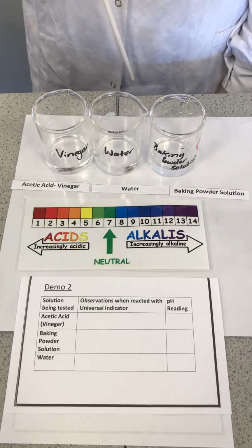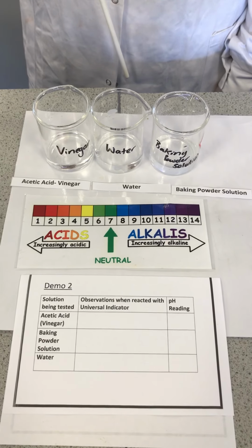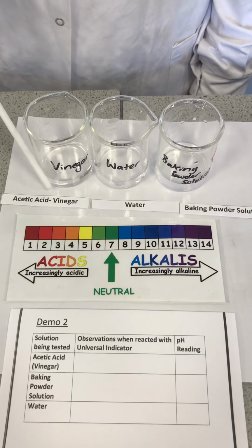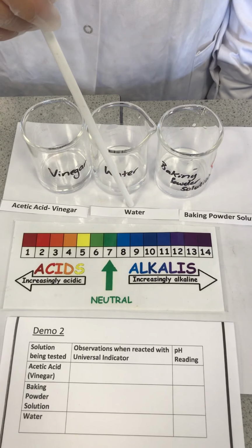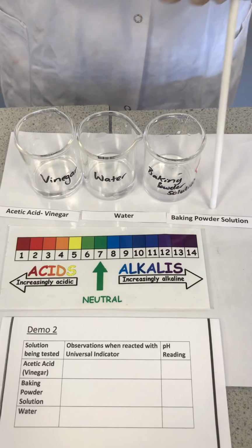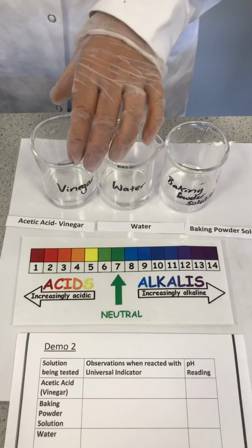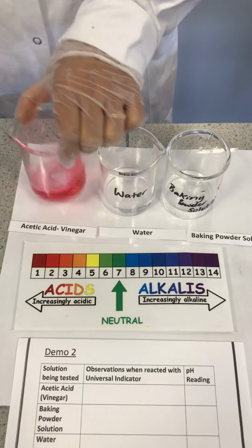Experiment 2, neutralization. Mixing acid and alkali together to make salt and water. We have 3 different beakers which contain vinegar, which is acetic acid, water, and baking powder solution, which is sodium bicarbonate, an alkaline solution. We add universal indicator solution to each and see the color change.